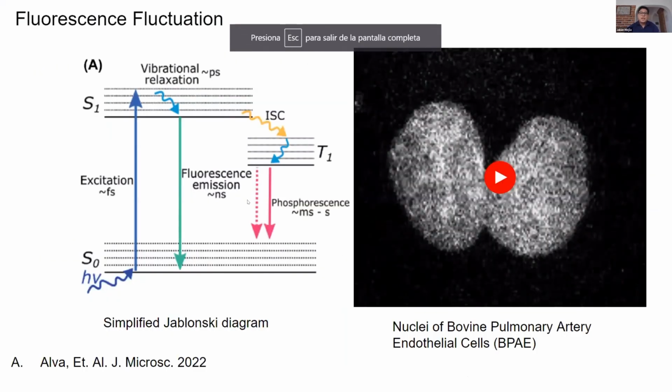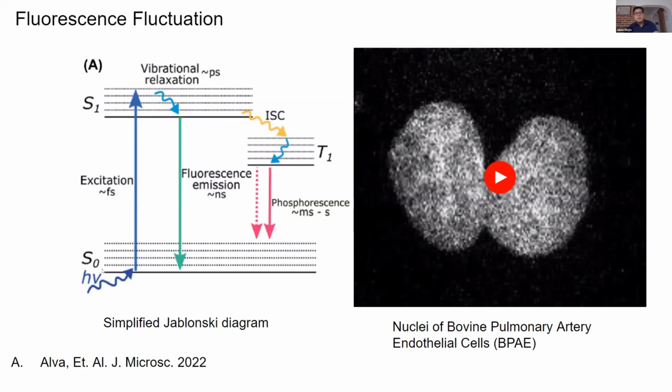Okay, what is super resolution based on fluorescence fluctuation? Typically, microscopy is about observing teeny tiny things, but there is a limit inherited from the nature of light. You can observe, on average, things larger than 250 nanometers, and there are several ways to push that further.